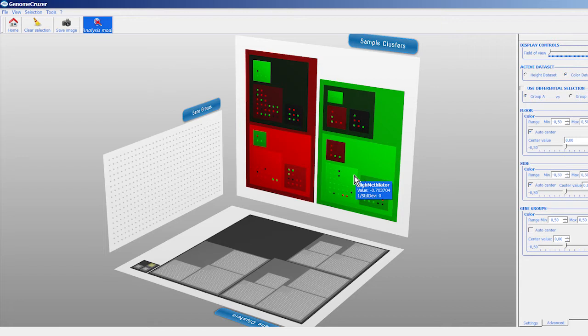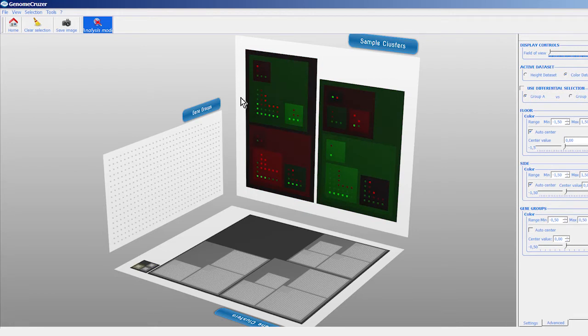And in this case, even if the molecular trait is scattered around the different sample clusters, in any case the correlation is clear because of the color code used to define the feature. If we look at the stage, again we can see its values around here, and in this case stage 1 samples are in bright green, while in dark green we have stage 2, in dark red stage 3, and in bright red stage 4 samples.